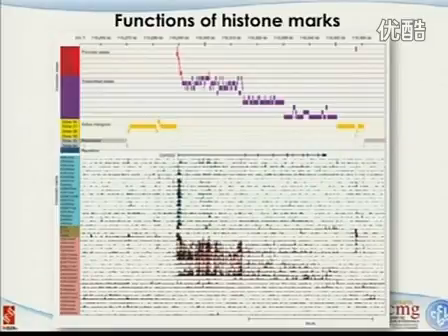And here, for different histone marks and for different bins in those regions, is what the signal enrichment looks like. Okay? So this is completely based on the experimental approach, nothing computational at this stage. And this is really not the best color combination, but there's no way I can change that.